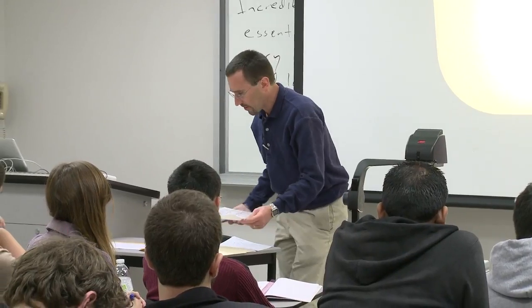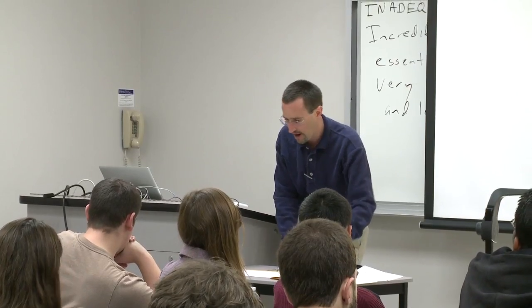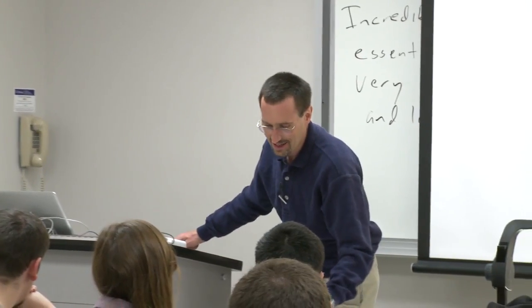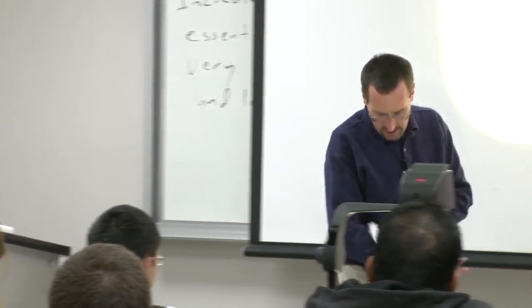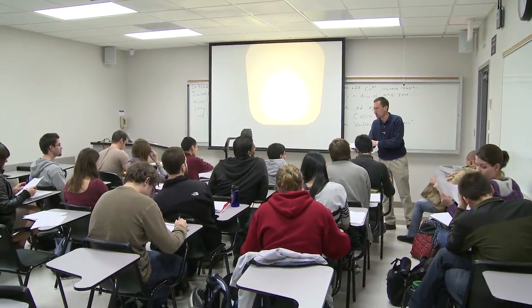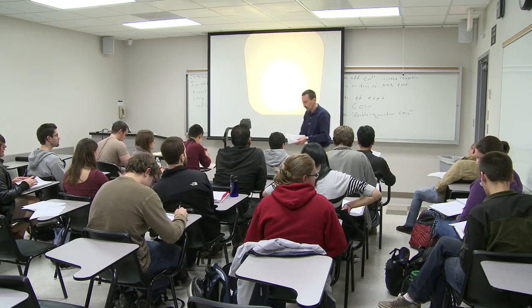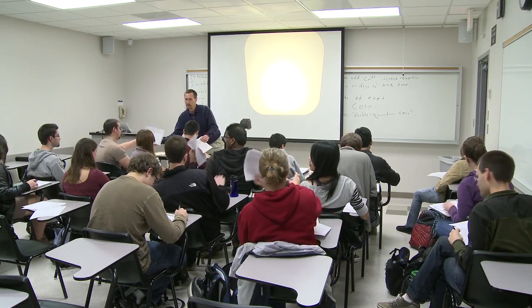And as I said, very, very powerful, very tempting and teasing because, of course, it is so powerful and yet very frustrating because it isn't something that you can pull out except in heroic circumstances. So this is the handout from Nakanishi's book on the technique, which, what I like about his book is he always has just sort of a short little paragraph on the technique and then an example here. So this particular molecule happens to be the monoterpene menthol.